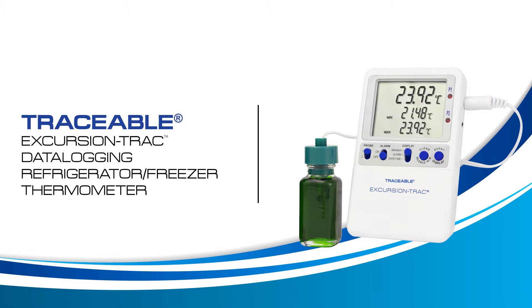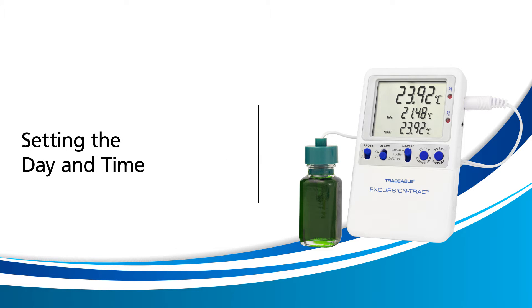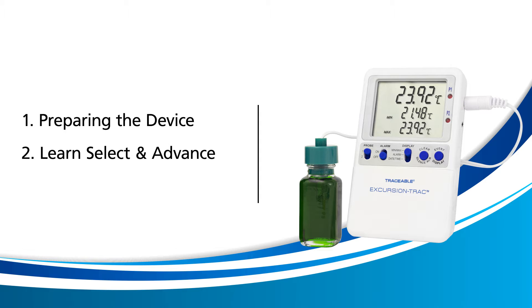Welcome to a Traceable Products instructional video for the Traceable Excursion Track Thermometer. In this video we will learn how to set the day and time. To ensure we provide the best learning experience, this video will be divided into three small lessons: preparing your device to set the day and time, learning about the select and advance buttons, and then using those buttons to set the day and time. We also recommend that you have your device with you so you can follow along.